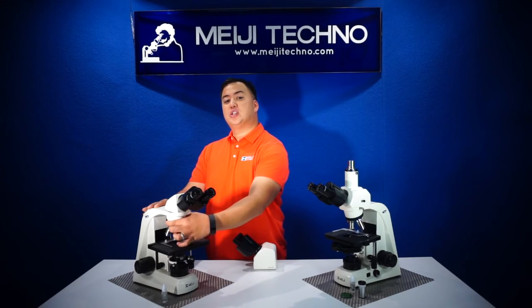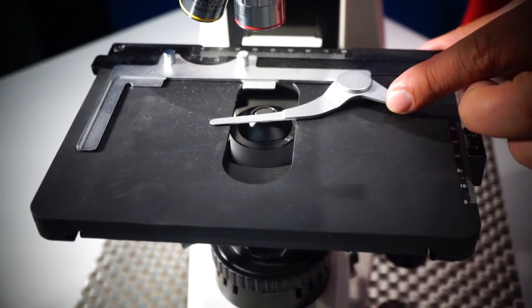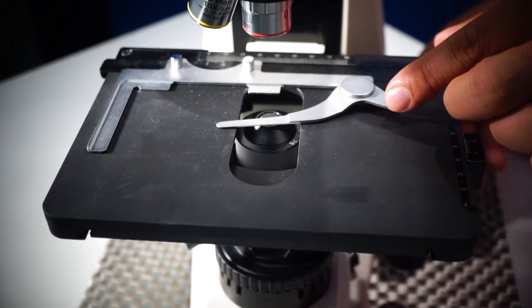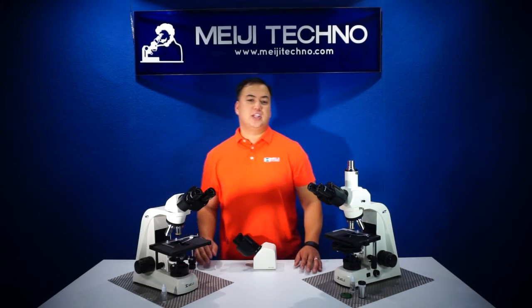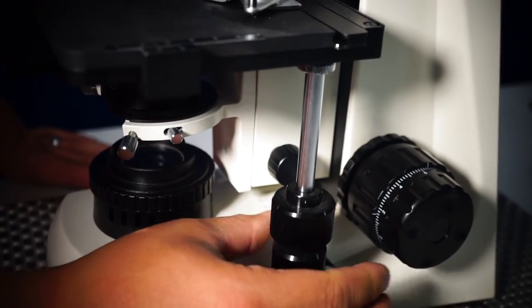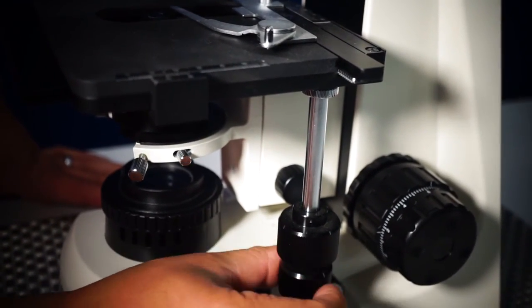The MT4000 also comes with a standard 170 millimeters by 140 millimeters flat-top stage, as you can see here, for XY coaxial control. The stage is also available with a reverse drop-down control on the left side for left-handed users. Both stages provide a clean ceramic-coated surface for maximum protection against abrasion and wear and tear for years of use.